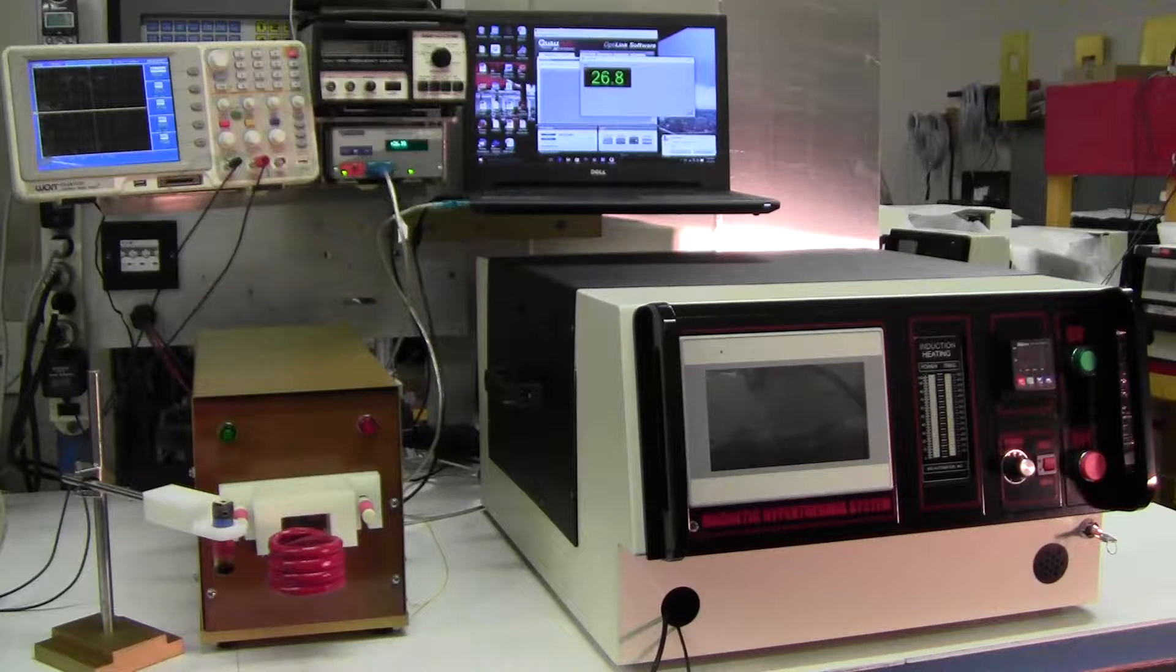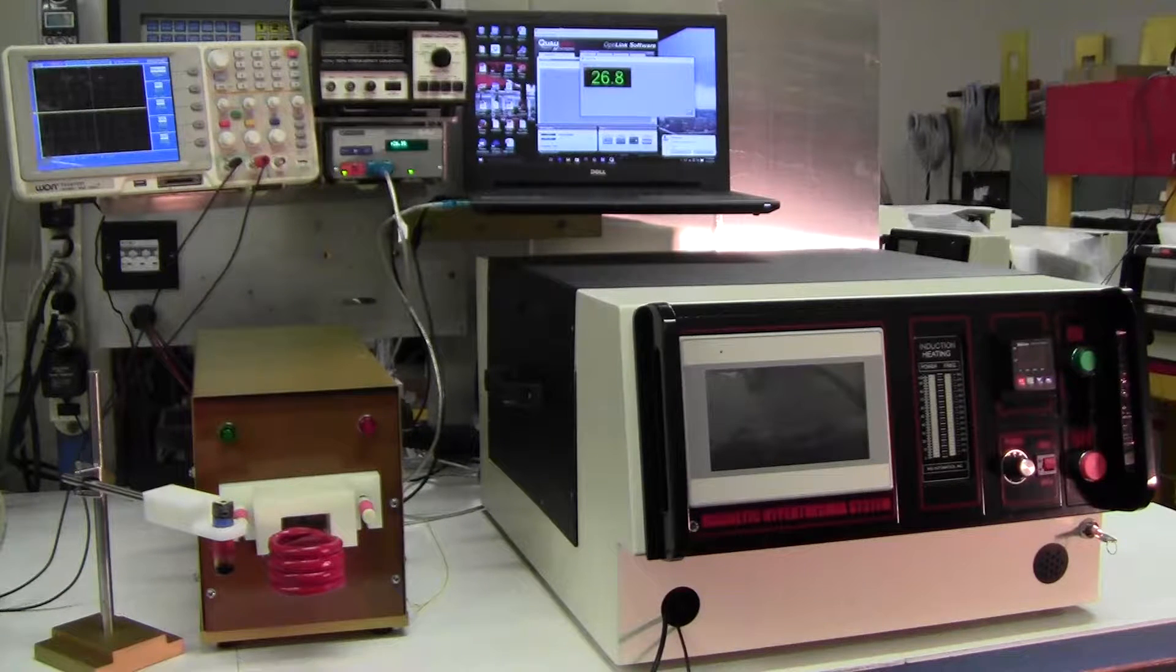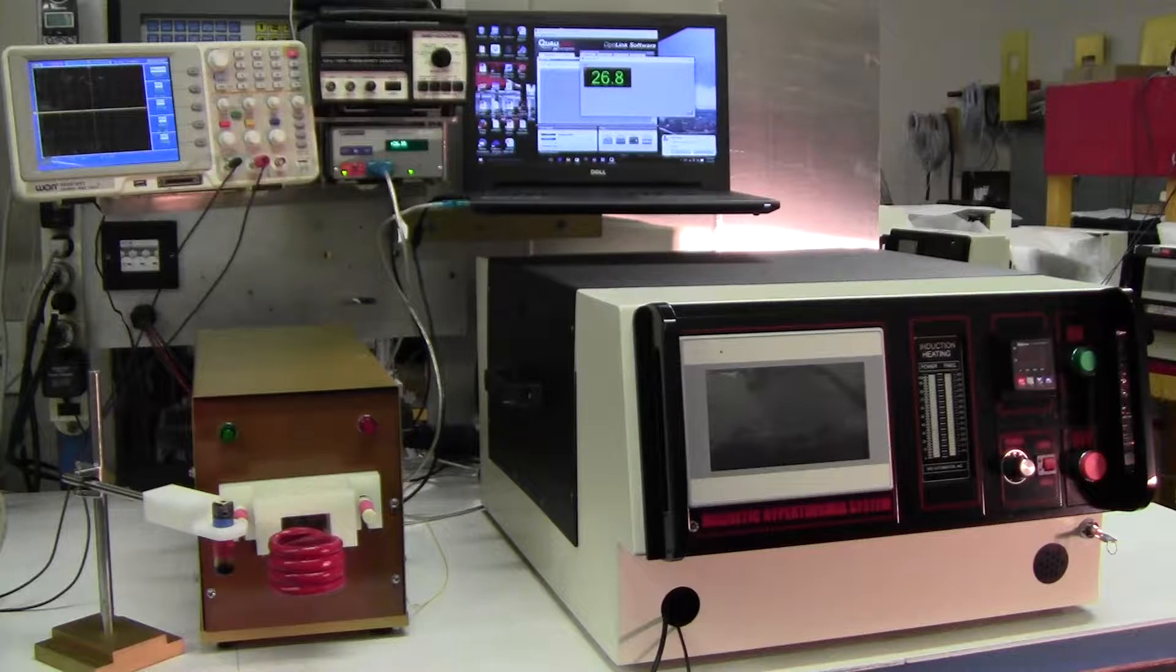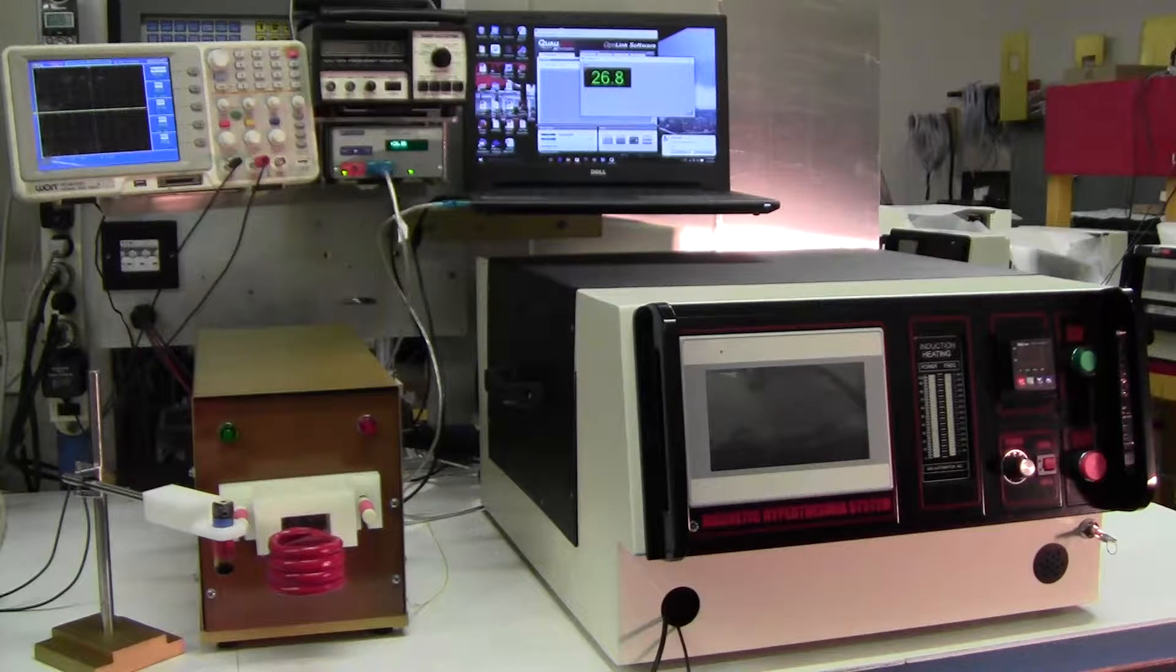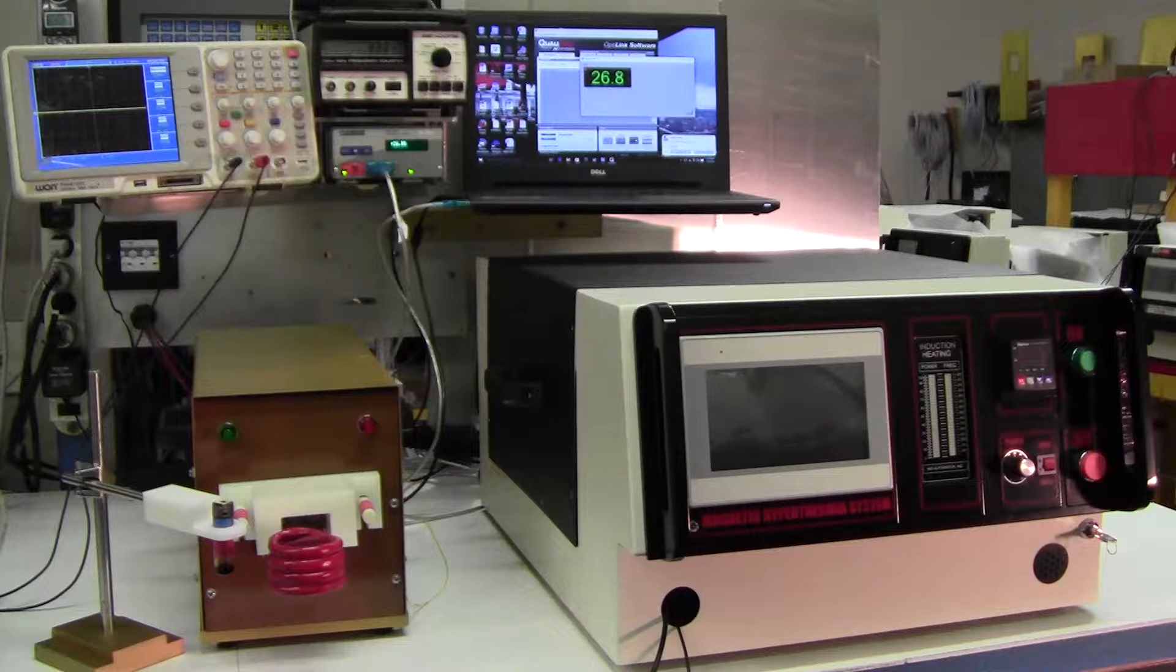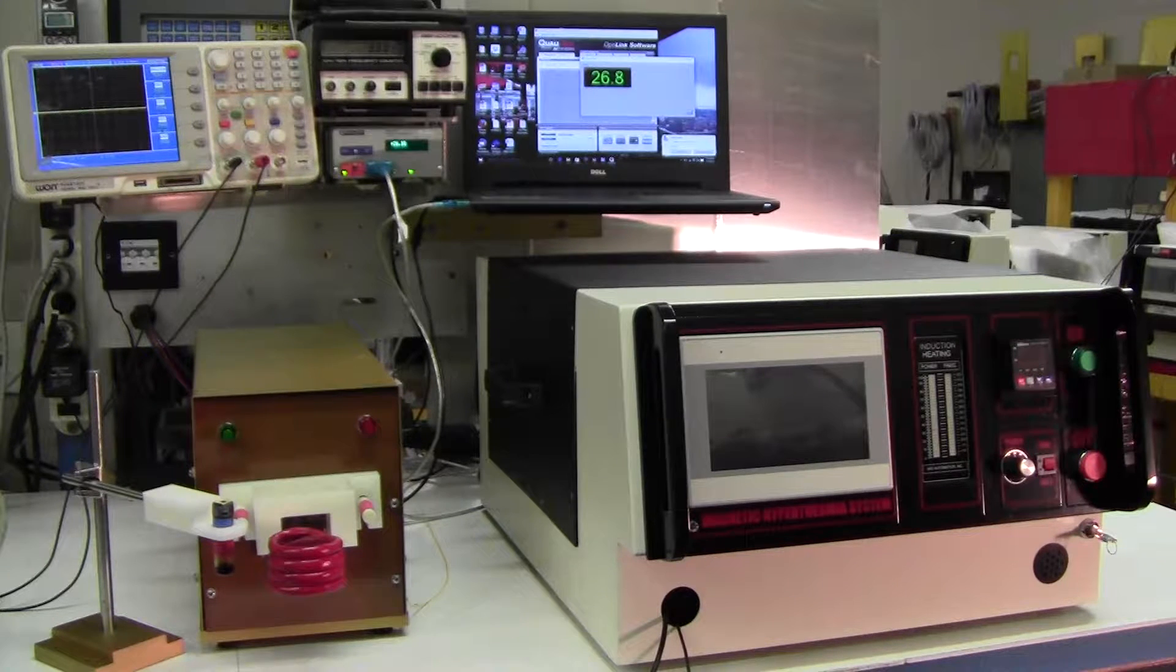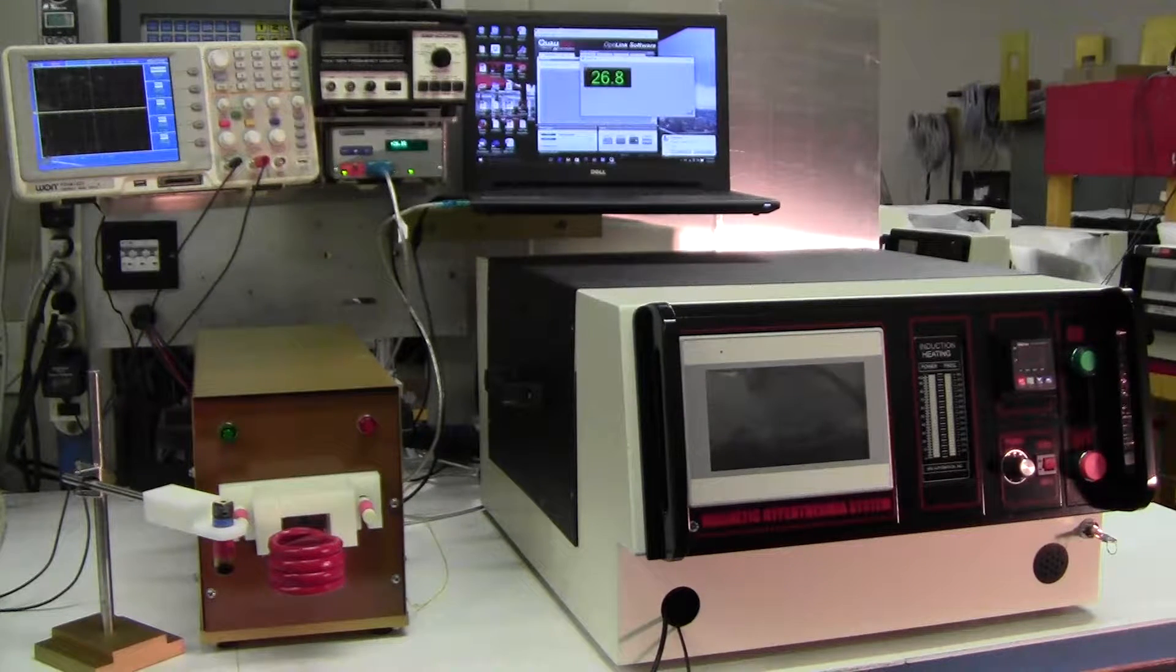The treatment of both animals and potentially humans require different types of heating coils. What we'll be using today is a round heating coil operating at around 410 kilohertz to demonstrate the heating power of the unit. So I'll turn the machine on.